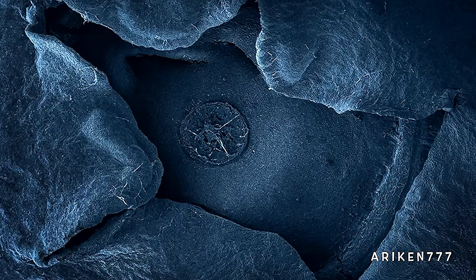A close-up of a tasty and widely popular fruit, a blueberry.